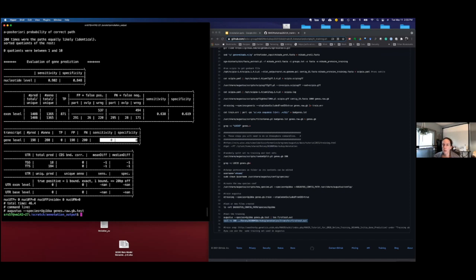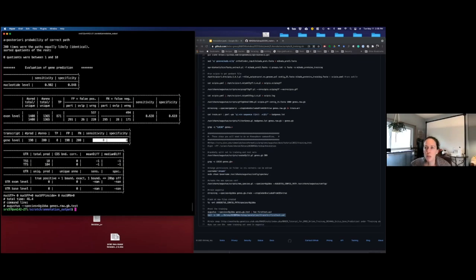So you'd probably want to go back and maybe do some manual curation on that training set, or maybe try another way of making a training set. You could look at sequence identity instead of maybe using OrthoFinder. Every genome's different, and I've found that what works for one genome doesn't necessarily work for another. So basically you just work on tweaking things until you get something that's acceptable.